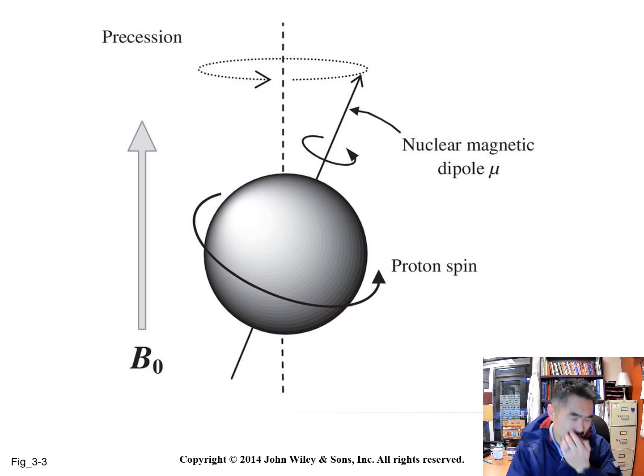We're not going to spend too much time on other spectroscopic methods, although we'll spend a good amount of time thinking about mass spec a little bit because it is useful. But most of our class is going to be using NMR, so you'll be by that magnet, and you'll be using Mnova and stuff like that quite a bit. Also, you'll be looking at quite a few spectra from the NMR textbook. Hopefully you bought it already, because I want you to start working on the dry lab 1 assignment pretty much now.